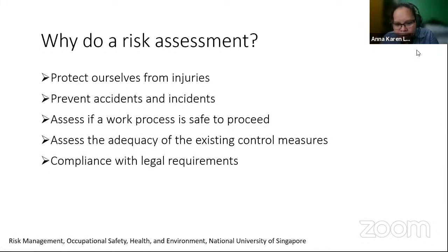Can some of the audience give some feedback regarding the requirements? Is it required for laboratories to provide risk assessments here? Safety risk assessments? Perhaps in the industries? Usually it's part of the management systems. In industries, there's not much of a problem. That is usually part of the environmental health and safety requirements of the industries. But in the academe, it's still rare, I would say.